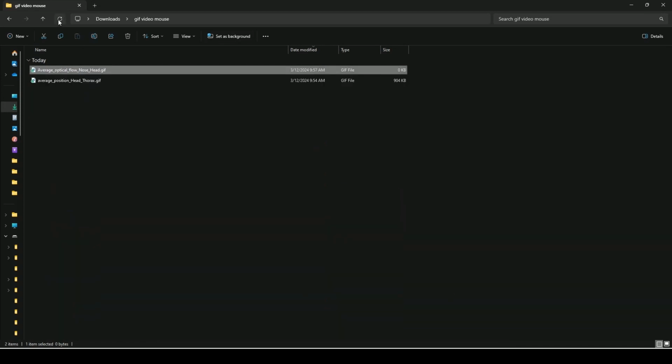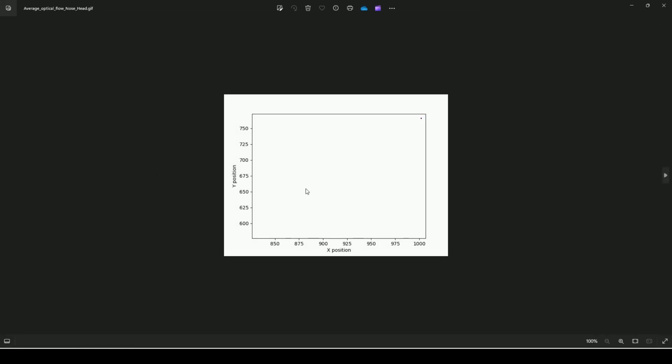After the GIF is generated, wait a couple of seconds for the size to update, and then you can start to see at each mouse position the arrows are changing because of the velocity magnitude change.